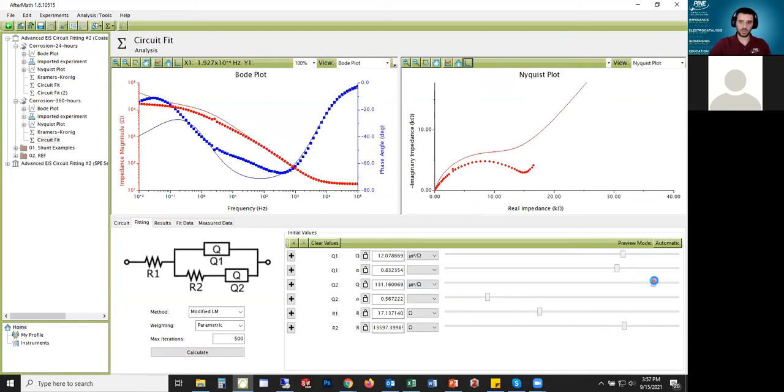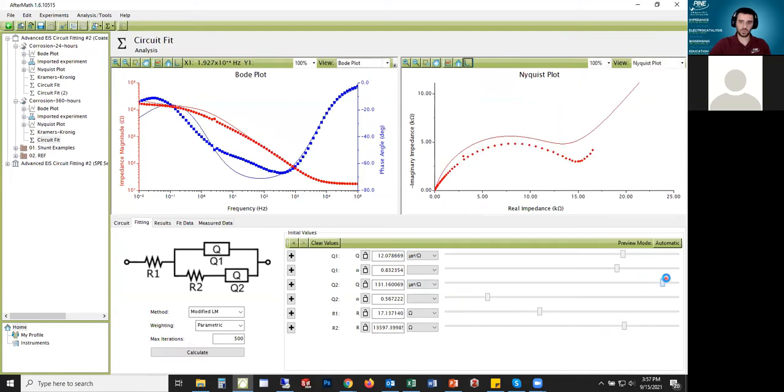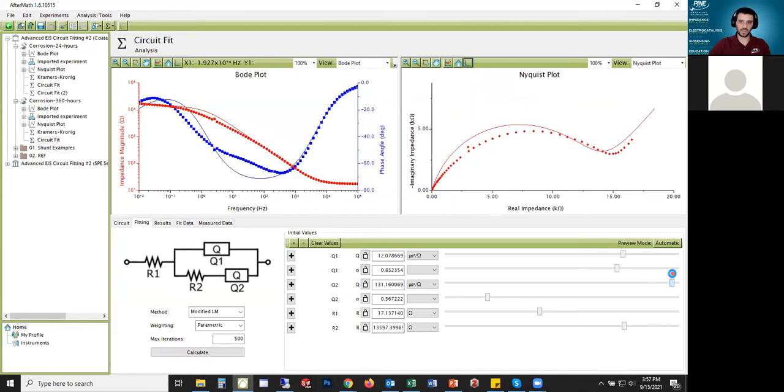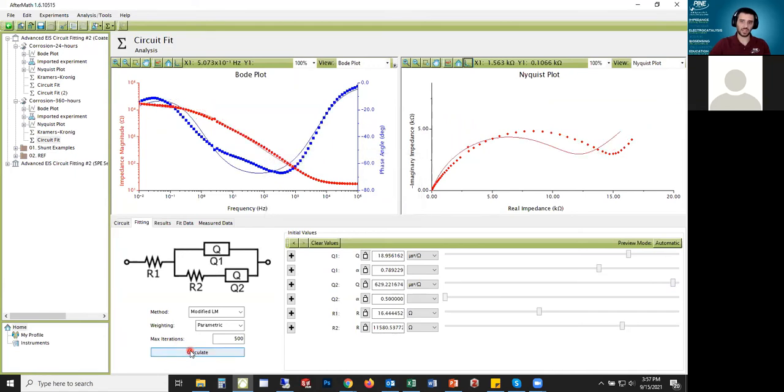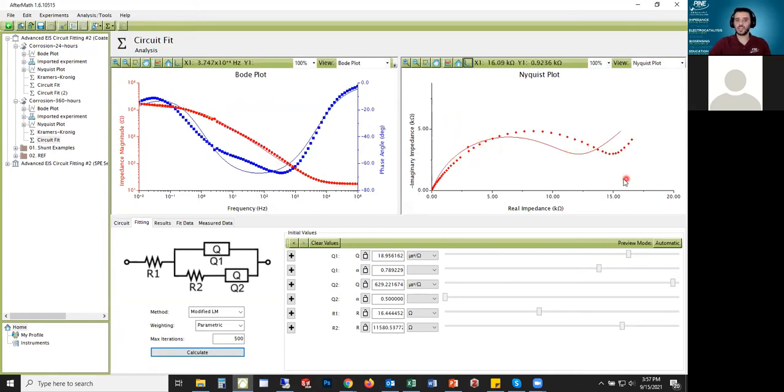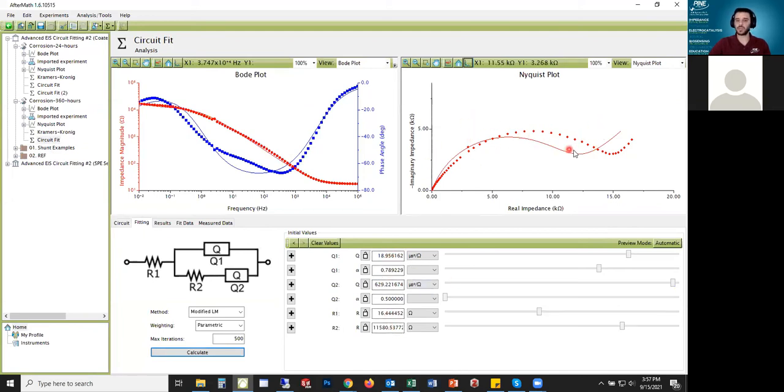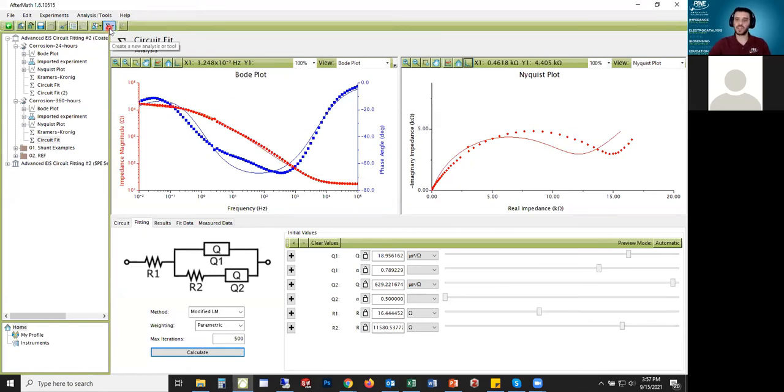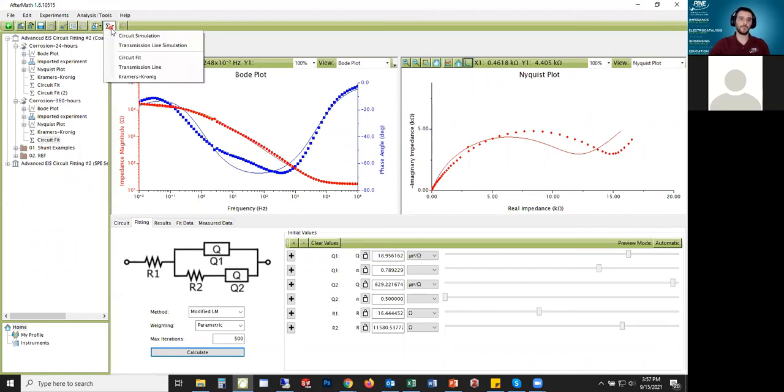Right away, the Nyquist plot is getting pretty close, but the Bode plot is actually getting farther away. When I try to calculate this, it just won't get there. This is clearly not the right circuit, but it's close. It could be almost like a starting point. This isn't the right circuit to use, but I just thought I would illustrate starting simple.